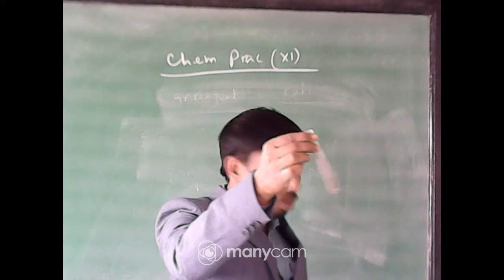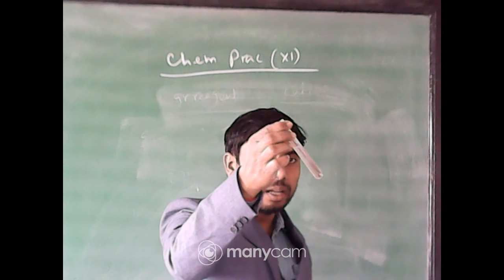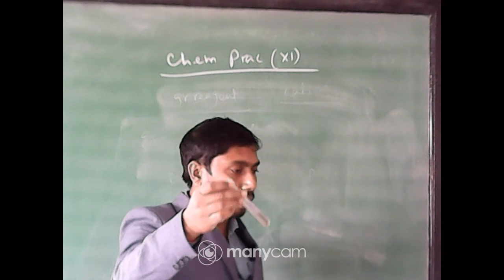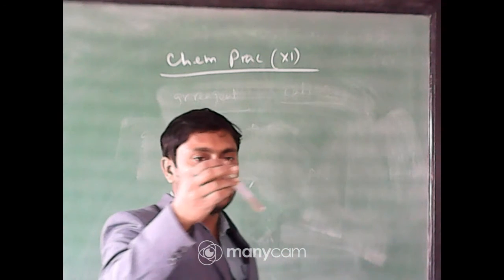Looking like that, the PPT is floating on the liquid. So this is called the floating PPT test for aluminium. This is the confirmation test for aluminium. So aluminium is present in group 3.